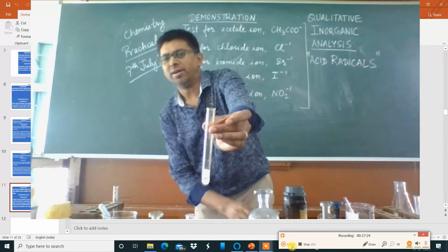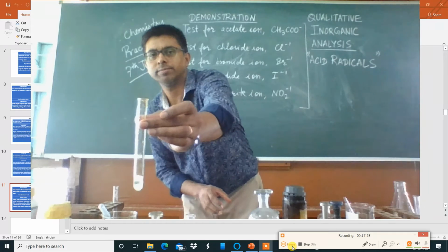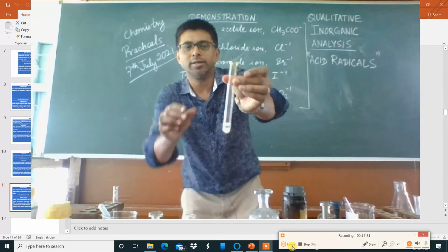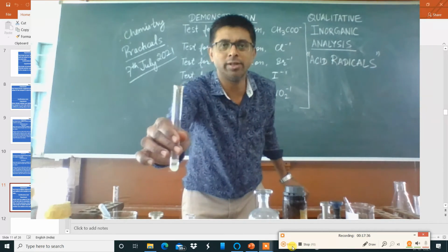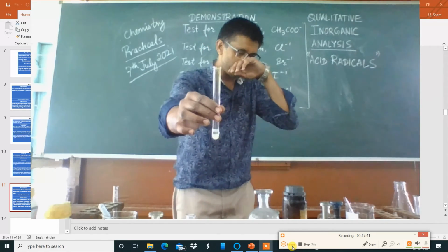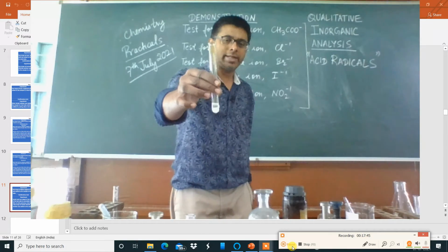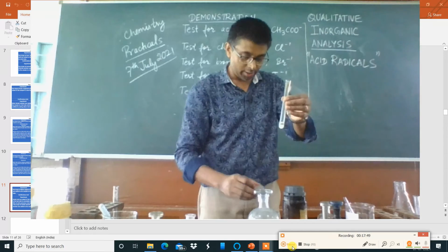After that, the smell of the gas is supposed to be pungent. Whatever gas comes out has a pungent smell.